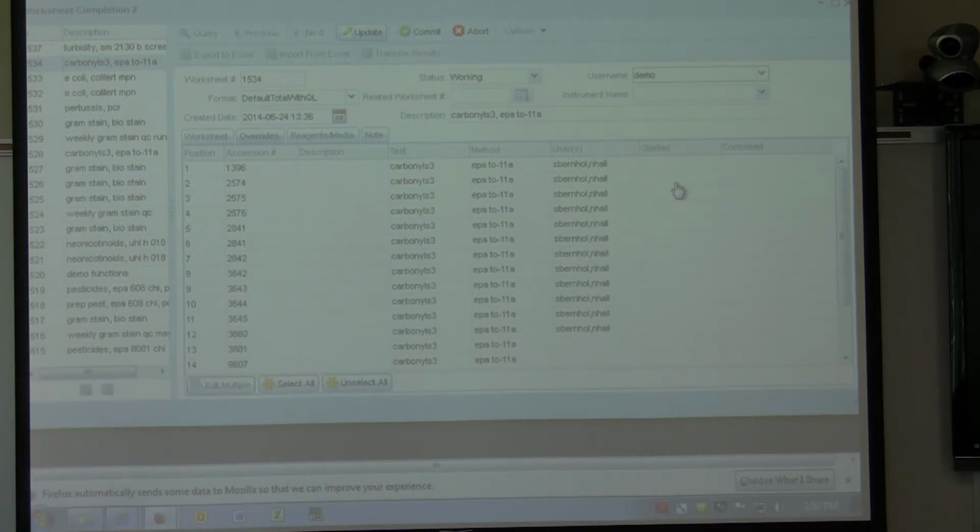Yeah, well, really, this is the started date that's being carried over, because it's got their username and the date started. That's what I'm copying, the entered prep from the previous worksheet. Right, but then that number gets changed. And so it's now showing, instead of their prep date that they actually did say 3 days ago or whatever, is it showing the date that you put it on the new worksheet? Yes, that's it.